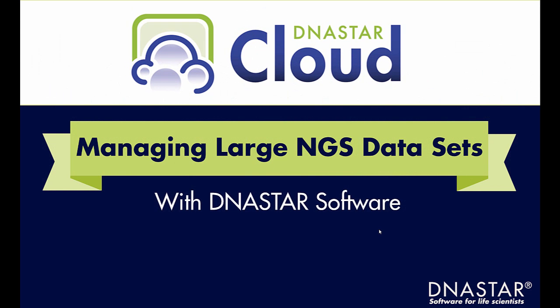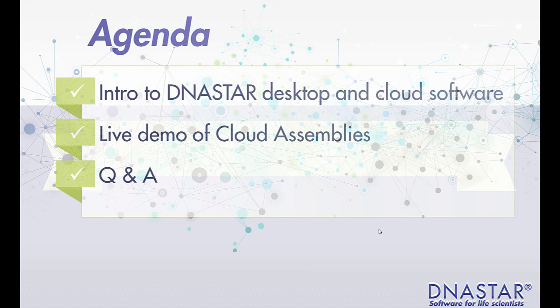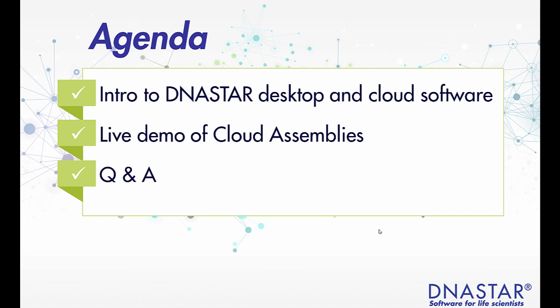So today we're going to be talking about using DNASTAR Cloud to manage large next-gen sequencing data sets. To get started, I'll give you a brief introduction to DNASTAR software, including our applications for desktop computers and the DNASTAR Cloud. And then we'll get into a live demo of cloud assemblies as well as some downstream analysis options. And then at the end, we'll have time for some questions.